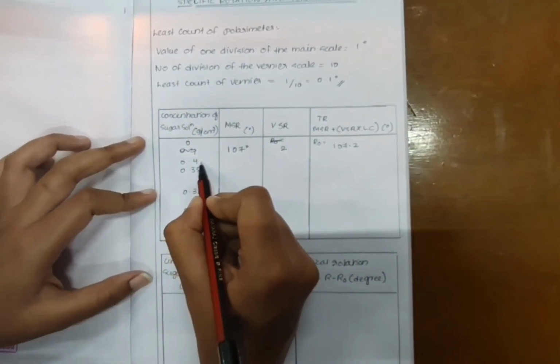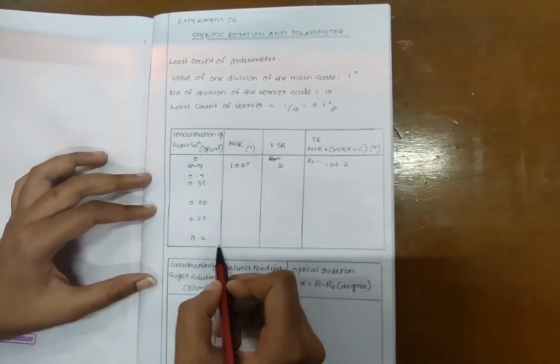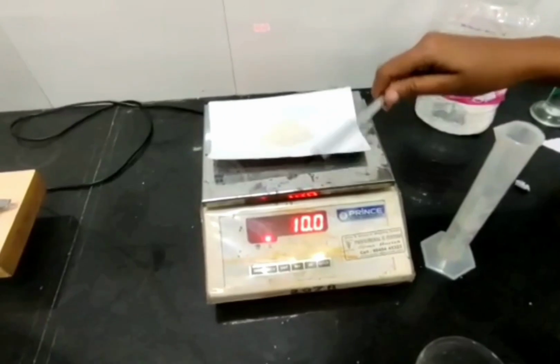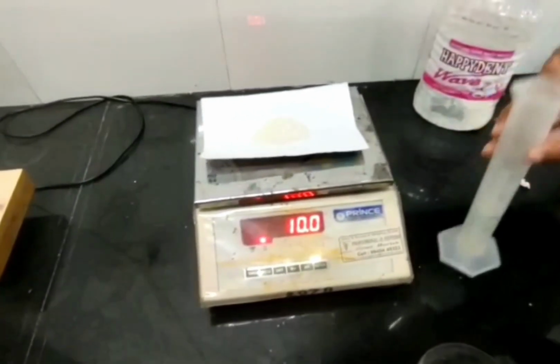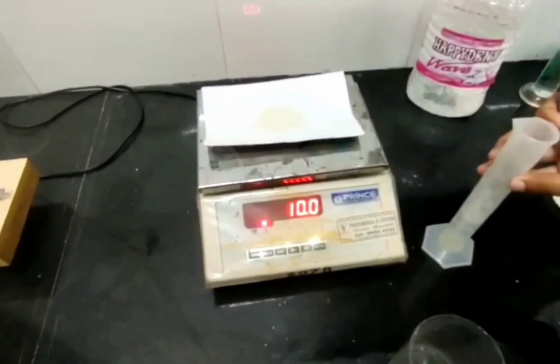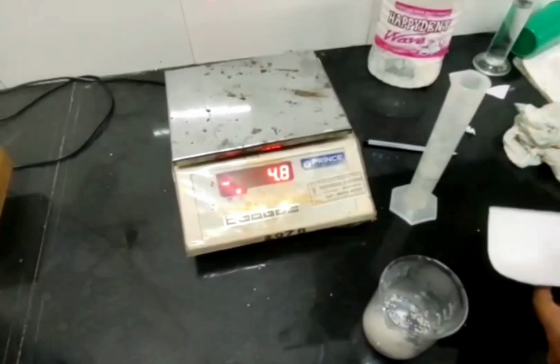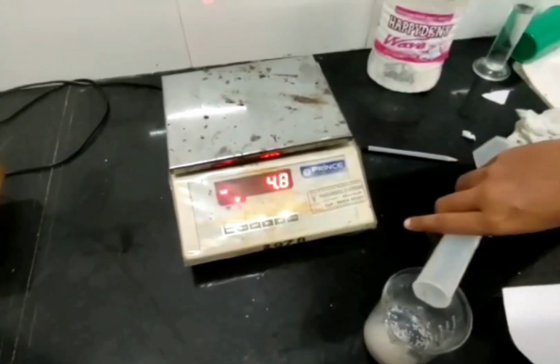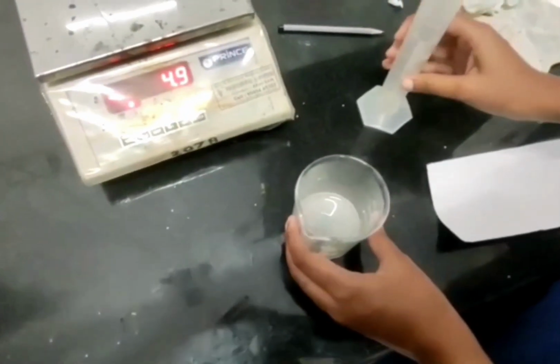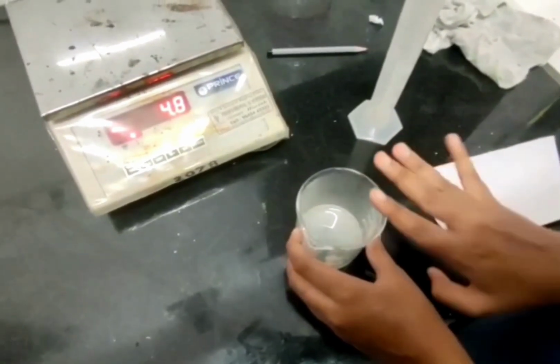After this, we are going to find the R values for different concentrations of sugar solutions. Now, we have taken 10 gram of sugar and 25 ml of water. As you can see, now we are going to dissolve the sugar in the distilled water, so that we have got 0.4 gram per centimeter cube of sugar solution.